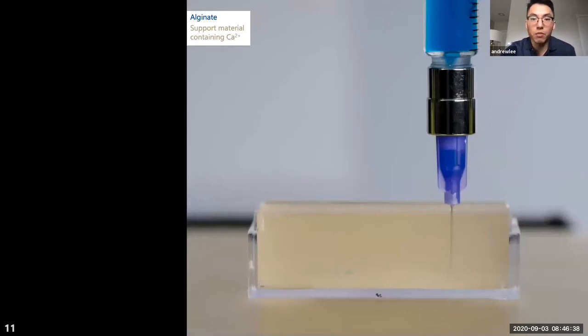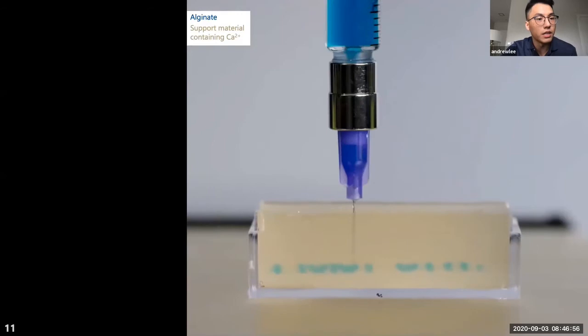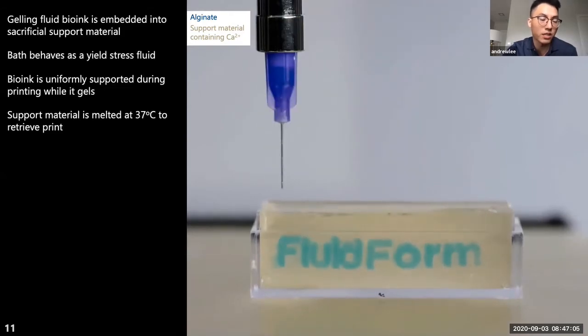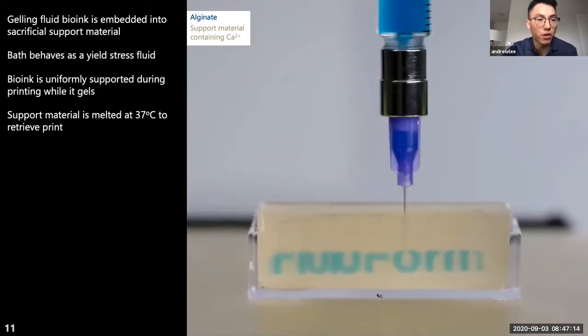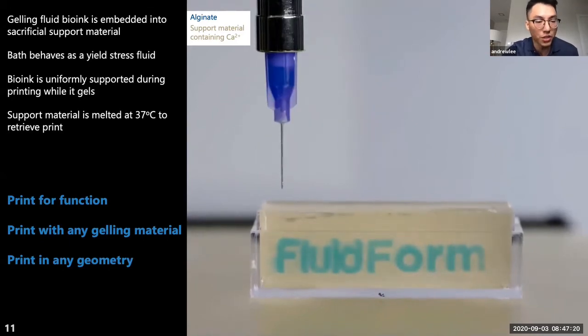Here we are printing a blue alginate material, which, if you're not familiar, will cross-link very rapidly in the presence of calcium ions. So we have calcium ions inside the support material in yellow, and when we start printing, you can see that the alginate ink is being deposited layer by layer. We're printing the letters FluidForm. While it's printing, the calcium ions in the support bath begin to cross-link the hydrogel so that it solidifies, and then you can raise the temperature of this entire system to melt away the gelatin microparticles. And this is really what allows us to print freeform with any jelly material and any geometry.